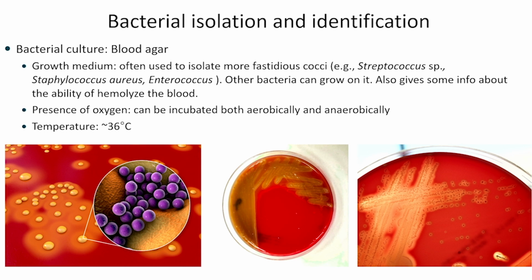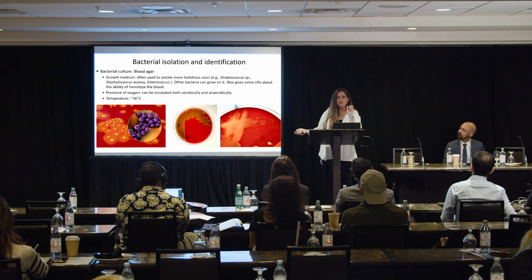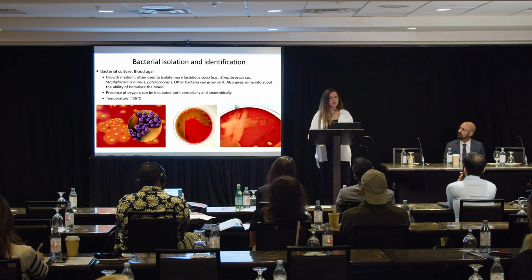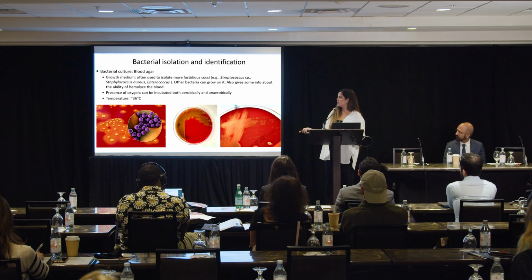And in a blood agar culture like this, you can see a lot about who they can potentially be, right? The shape of the colonies, and even if they have the ability of breaking down the blood, and create this shadow around the colonies. We call this hemolysis, right? So the presence of hemolysis can already tell you if some of these microbes have these enzymes that can break down blood, which is very important for their virulence. And we can see that on the agar as well.